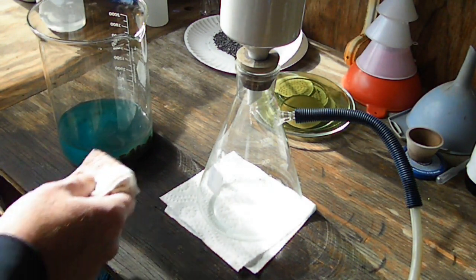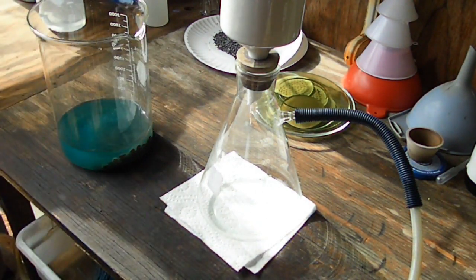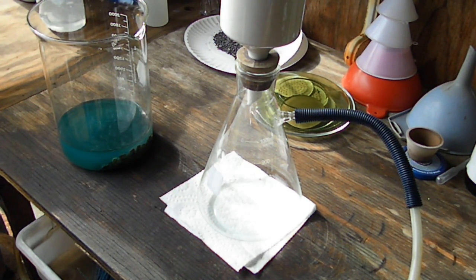There's no point in making you sit here and watch that, because I'm only going to use the vacuum when I get down to the bottom. I'm going to let it go through slow, and that'll help put some sediment in that filter paper so that it'll catch the other sediment better. So anyway, when we get this filtered off, we're going to do this big one first.